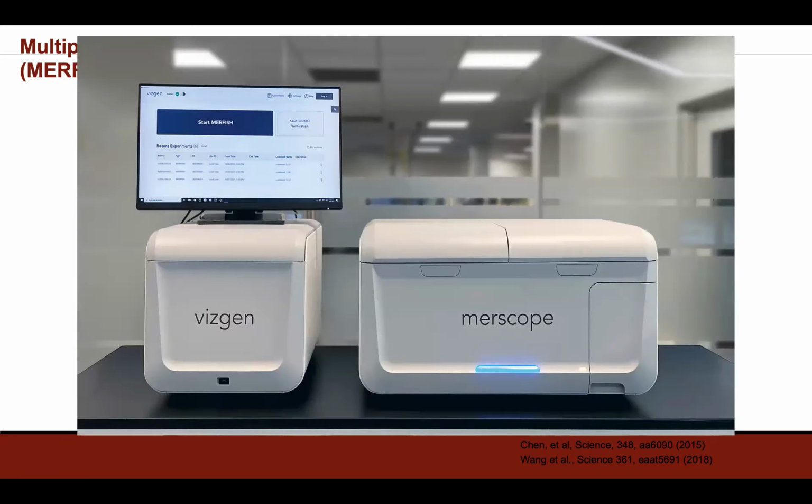And the system that is commercialized is called MERSCOPE by Vizgen. Both systems are available right now on the market. And this system has been emerging as a very powerful tool used by many big projects, such as the Human Cell Atlas.